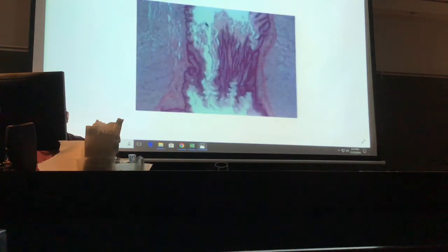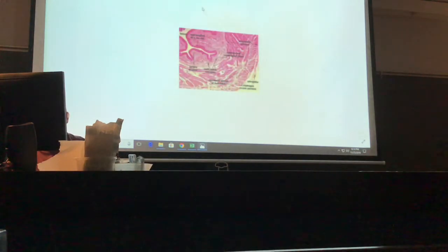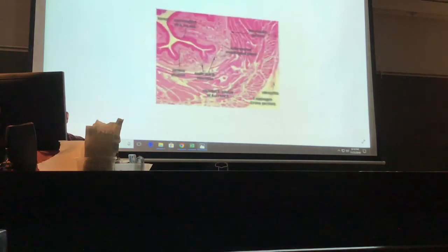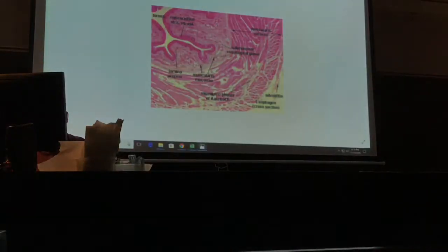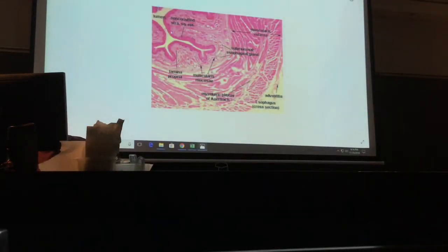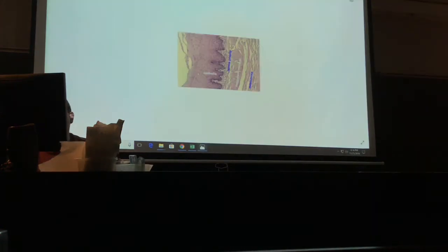The longitudinal view to give you a look at the esophagus from that direction. Here we go. It's a nice slide, labeled pretty well. Another unique feature of the esophagus. Note the epithelium here. This is stratified squamous epithelium. Here's a close-up look so you can see the epithelial, that stratified squamous, the lamina propria, and then the muscularis mucosa here. This is submucosa. But you can see the difference in appearance in the muscularis mucosa and the connective tissues that surround it.